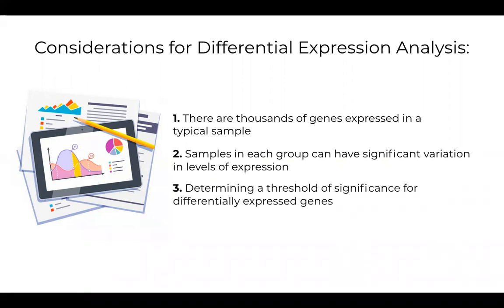Another important aspect is determining a threshold, which we decided based on the quantile. During the quantile normalization, we set a threshold of 5, and then there is a difference that we have observed. So it's hard to know what would be a significant enough difference to say that these are truly differentially expressed genes. That is something that is a hit and trial method.